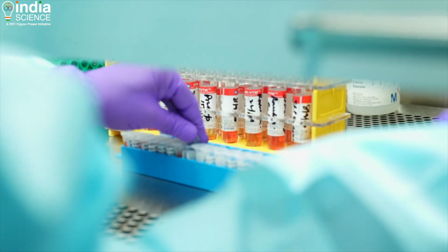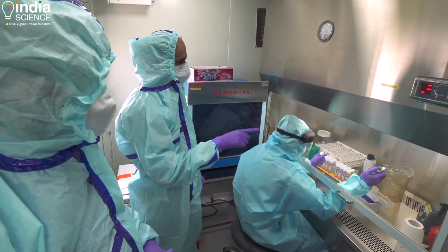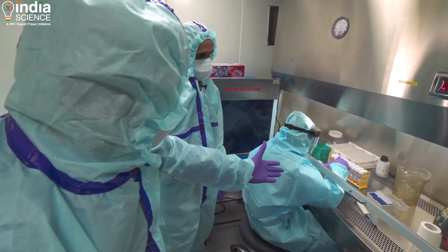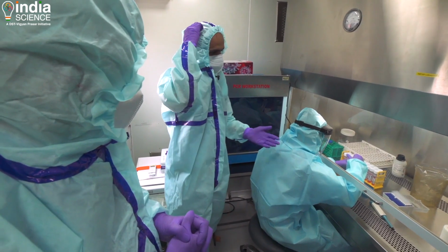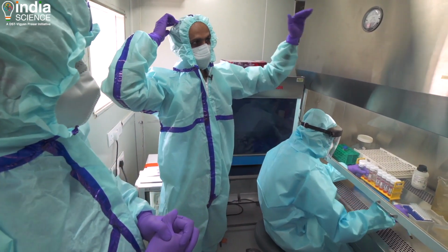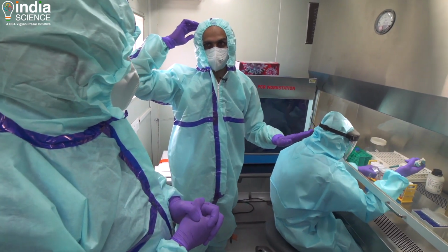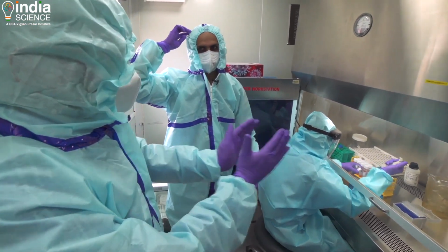So this is where the sample aliquoting happens. So you have VTM tubes which come here, and as you can see, we have 20 samples here lined up. So we have a person who's sitting inside this cabinet. What is this called, sir? Yes, so he is Dinesh, and this is a biosafety cabinet which is fitted with HEPA filter and is in compliance with all biosafety regulations of Government of India. So this is where your live virus comes. Yes. And then what do you do here?